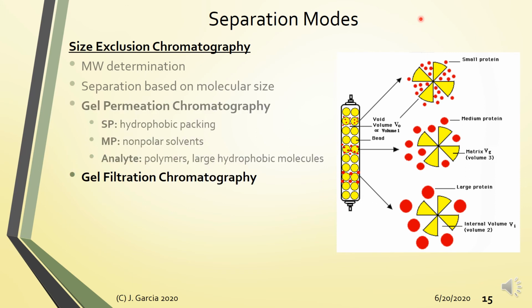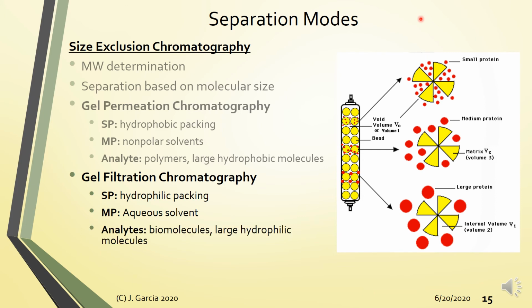Gel filtration chromatography naman are for polar solutes. Since polar, the stationary phase is hydrophilic in nature, whereas the mobile phase ay aqueous-based. So this is usually for biomolecules or large hydrophilic molecules.